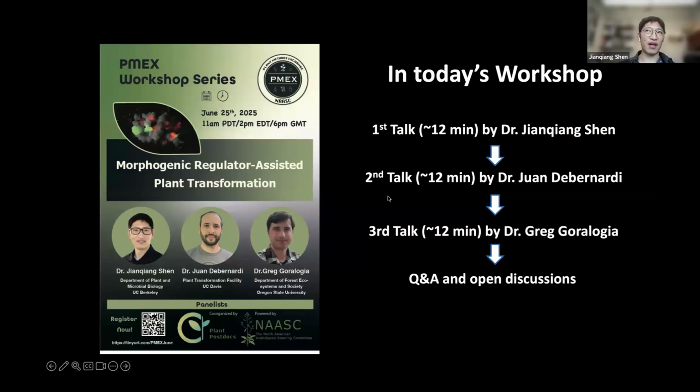In terms of chimerism, we have to separate two parts. One is that the transformants are chimeric. The other one is that the editing is chimeric. Editing chimerism, we also talked about, and we would probably use genetics to filter it. For transformant chimerism, typically if we use morphogenic genes and we start with a low transformation efficiency, the somatic embryo induction would automatically filter out a lot of chimerism.